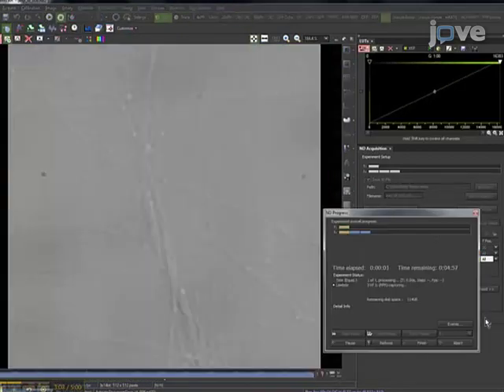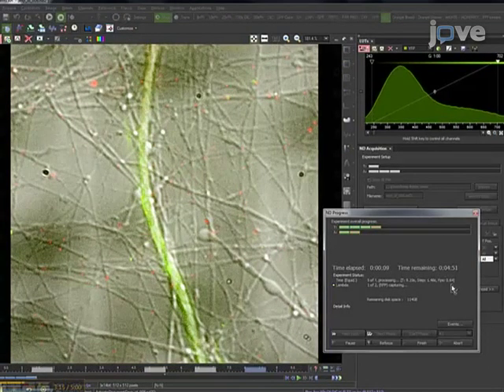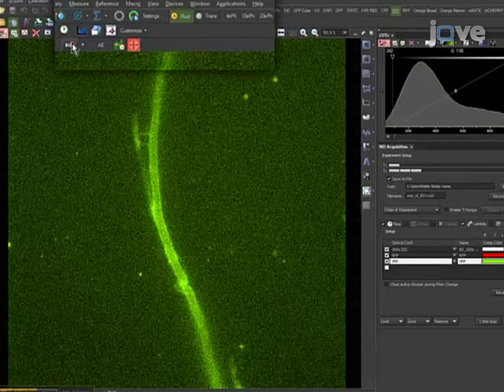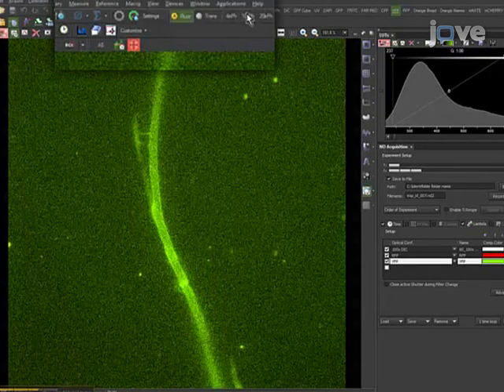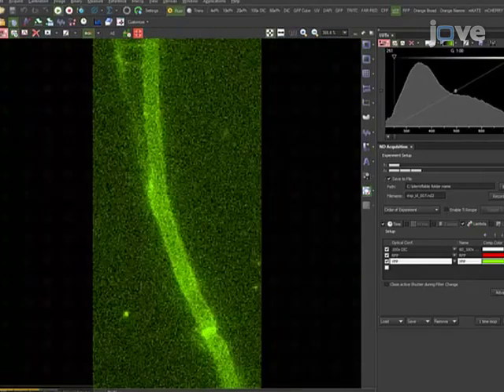The image acquisition rate is optimized through the exposure settings and size of the image acquired. Use the Region of Interest tool in NIS-Elements to define the region of interest, selecting an area between 25 and 50% of the total image area.